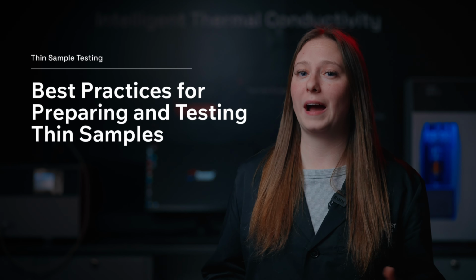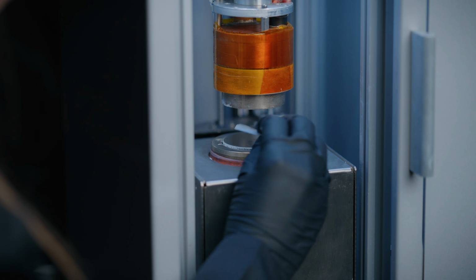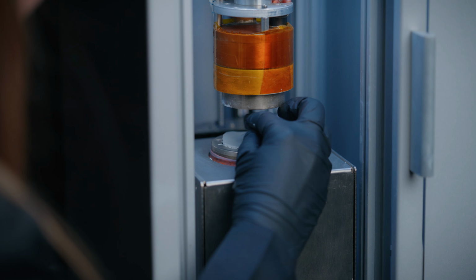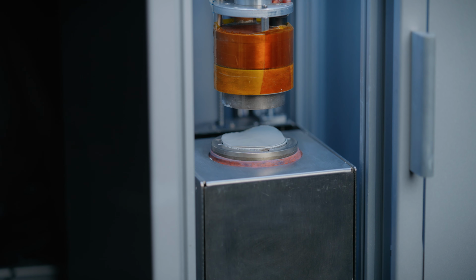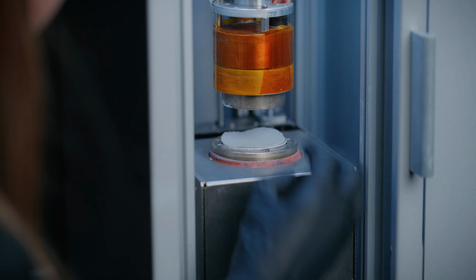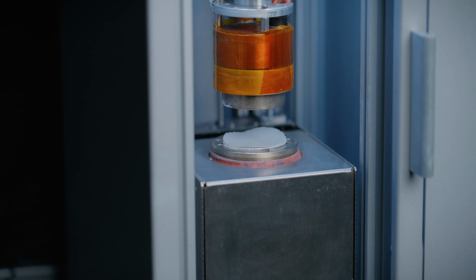So how do you improve accuracy and confidence when testing thin samples? It starts with preparation and setup discipline. One effective approach is layer stacking, commonly described in standards like ASTM D5470 and ASTM E1530. By stacking identical layers, you increase the total thermal resistance, making the measurement more sensitive to the film and less sensitive to noise. For this to work well, each layer must be centered, aligned, and laid perfectly flat, and thickness should be measured precisely using an accurate caliper.